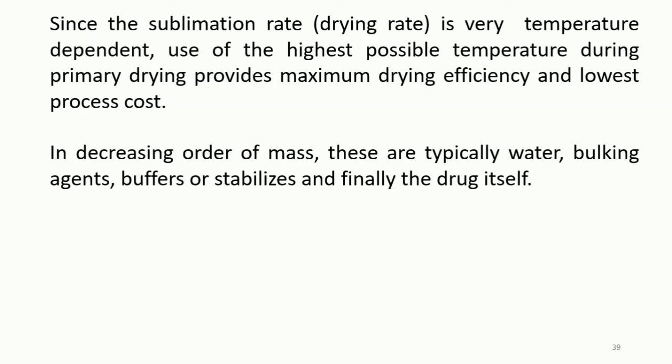Moreover, the process of freeze drying relies on the vapor pressure of ice. Even at temperatures as low as minus 50 degrees Celsius, ice sublimes and leaves a very porous, low density cake containing the stabilized drug.